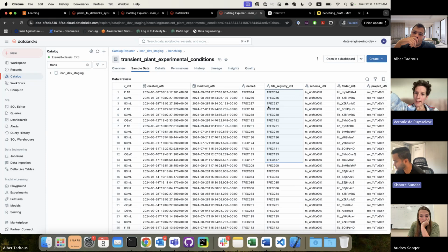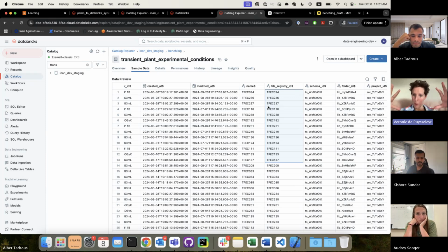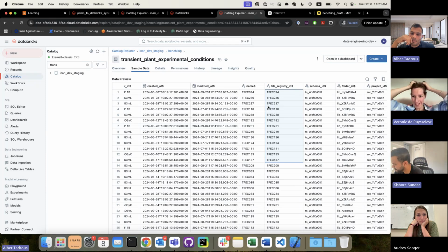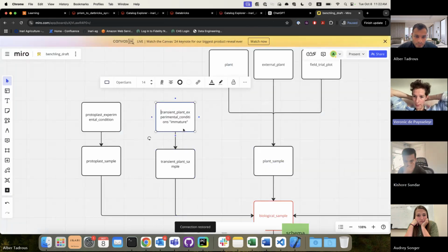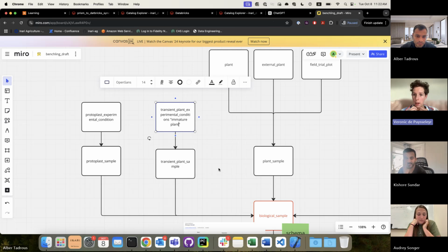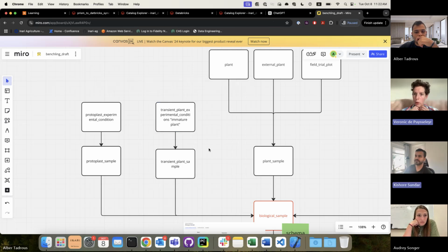And when we brought it to one schema, they wanted to have a unique code for their experiment names. And if we brought it together, they couldn't keep their way of naming things. So I agree that you can bring it to the same schema, as long as it's clear in the database that it is early sampling, because the sampling moment is extremely important for the data analysis, because the earlier you go, the more mosaicism you have, and you need to know that for analyzing the data.